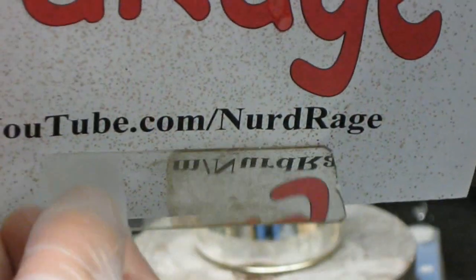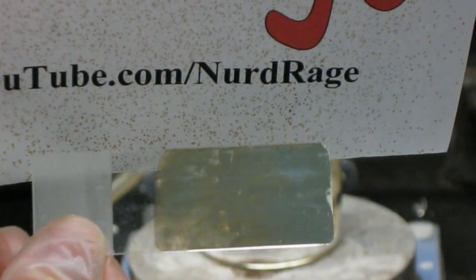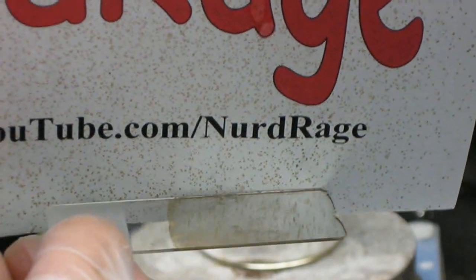And here we have a small silver mirror. The mirror isn't perfect because we didn't submerge it to the side completely, but you can see the idea.